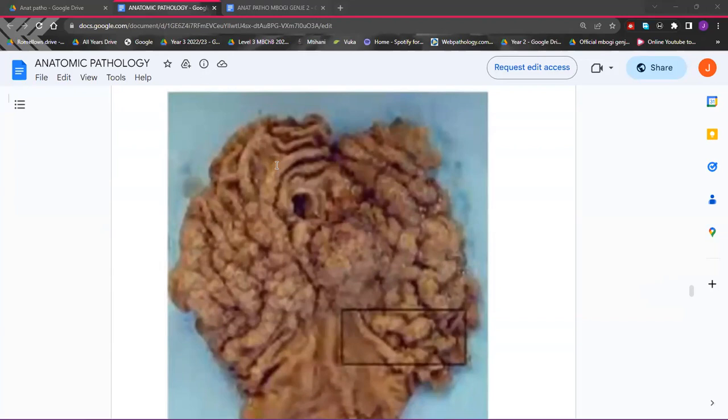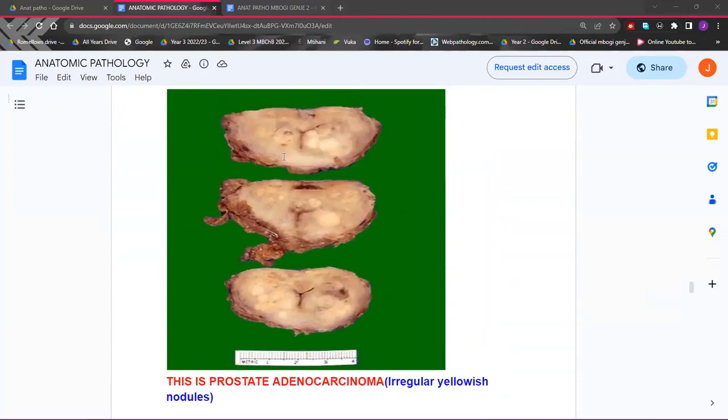For the diagnosis, maybe you can move up a little. The previous question: you are describing the gross morphology for this. So what do we see here? There's a slit-like opening or cavity. What else? Maybe in the parenchyma of this tissue, you can see something a bit abnormal color-wise. Someone says that the tumors are anchored at the periphery but growing inwards.